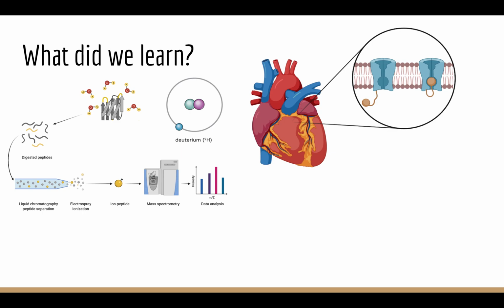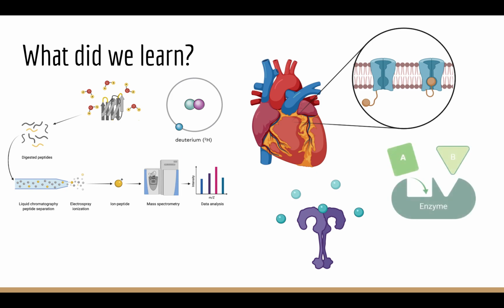From here, we can learn more about flexible loops of ion channels and how these proteins act within our organ systems. We can learn about protein-protein interactions this way, protein-drug interactions, protein-toxin interactions, protein-enzyme interactions. And from here we can learn more about the body, learn more about health and disease, and learn more about science.